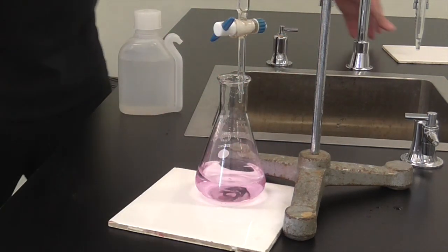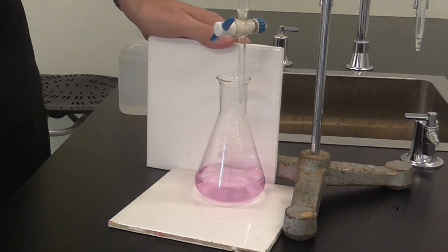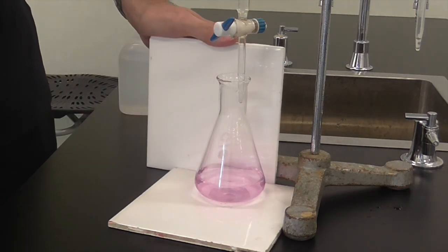Give it a shake and see what happens to the colour. So we've got our pink colour that we're looking for, give it a shake, let it sit and pop the tile behind it and that's a permanent colour change. So that's the end point of the titration.